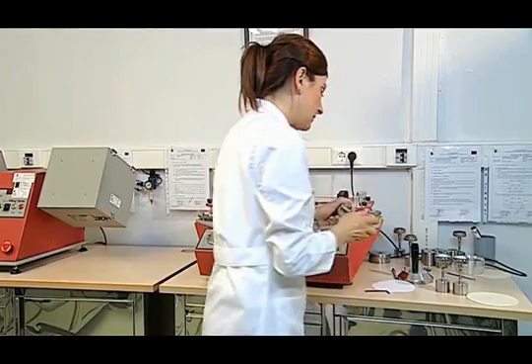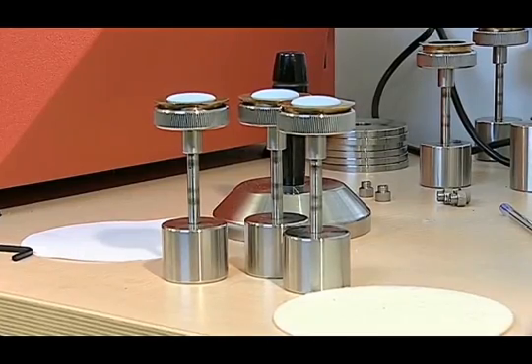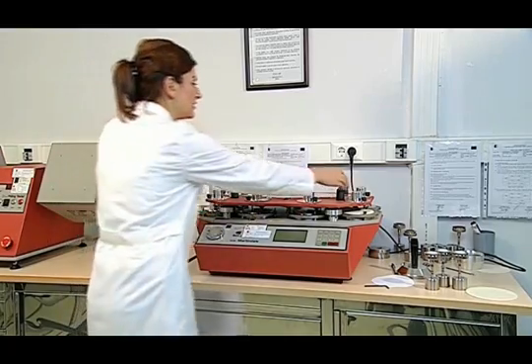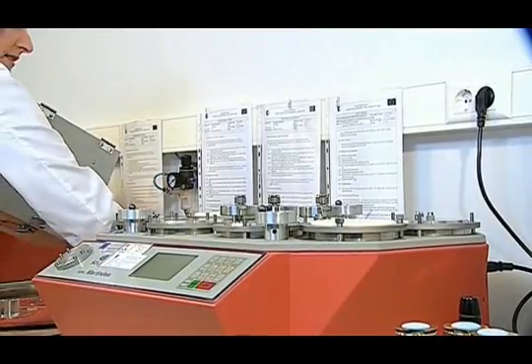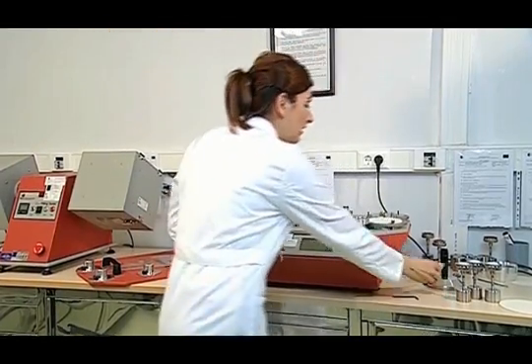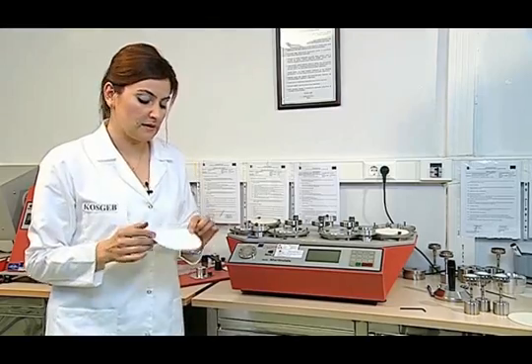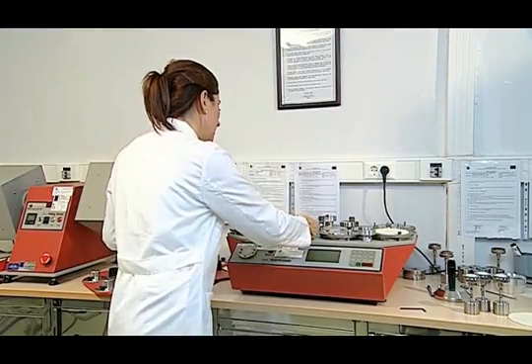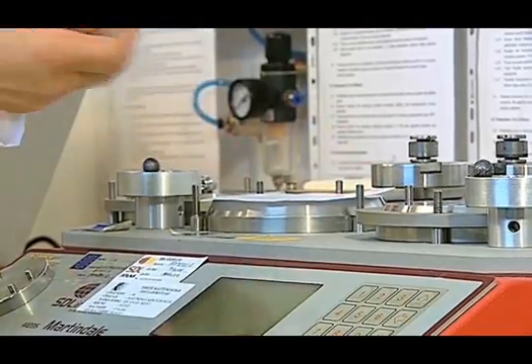The samples are placed in the abrasion device. First, the Lissajous pattern of the abrasion device is checked. For this, a sample of 140 mm wide and A4 sheet are cut. The sample we have cut is inserted into its slot on the abrasion table and the collar is squeezed.